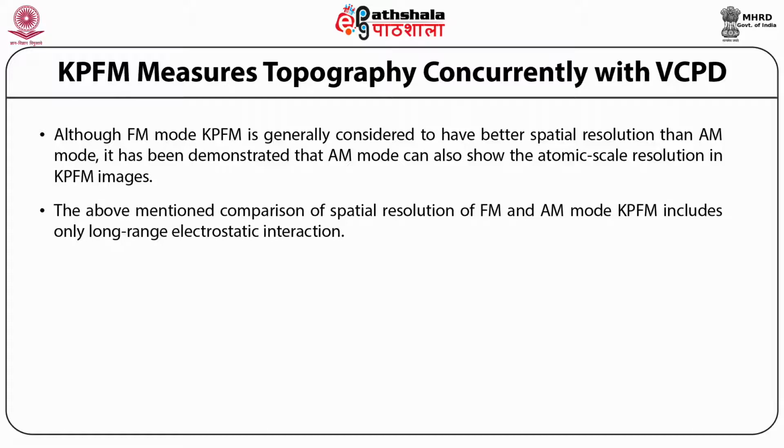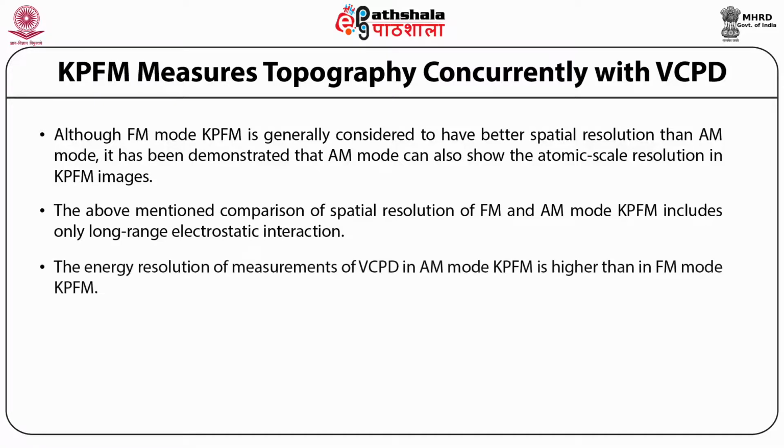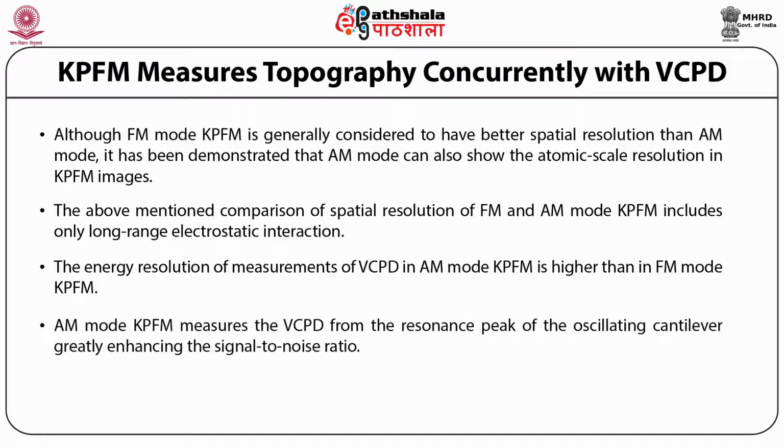The energy resolution of measurements of potential of CPD in AM mode KPFM is higher than in FM mode KPFM. AM mode KPFM measures the potential of CPD from the resonance peak of the oscillating cantilever, greatly enhancing the signal to noise ratio.